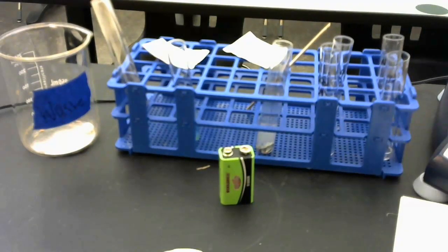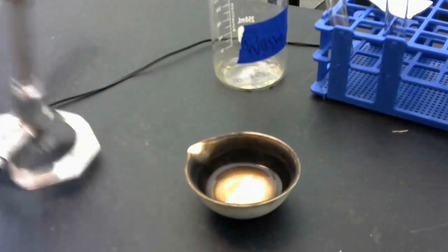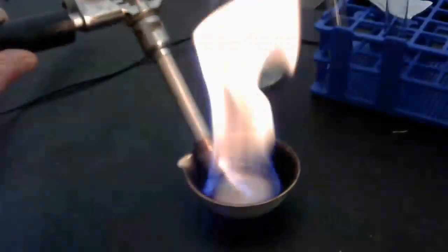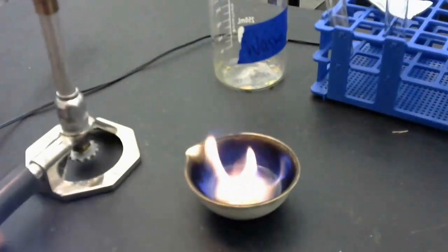Okay, so for my very last reaction, I'm going to do reaction type E, which is a combustion reaction. Combustion reactions are the reaction of a hydrocarbon, so a carbon and hydrogen containing compound, reacting with oxygen in the air to produce carbon dioxide and water. So what I have here is isopropyl alcohol, which is rubbing alcohol, and I am just going to put a flame on top of it. And what happens when you put a flame on top of rubbing alcohol? It is going to end up burning, and you can see that flame.